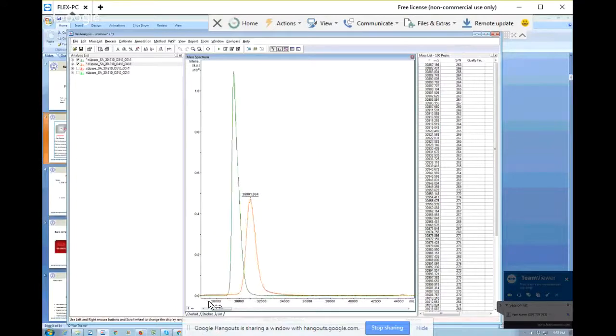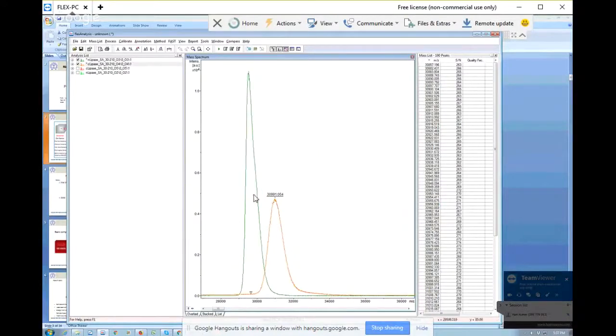So this is just one way in which we can use Maldi to find and represent how changes occur in a particular molecule. If there are some dyes that are attached to a protein, or some mutation that is happening, these studies can be taken up very well in Maldi.